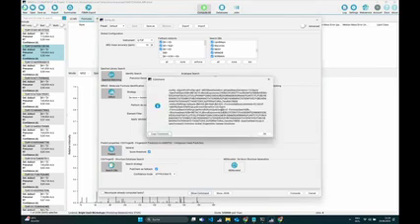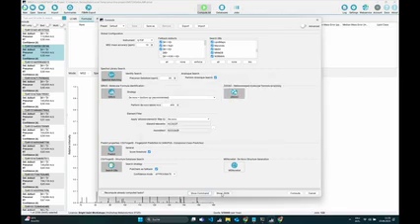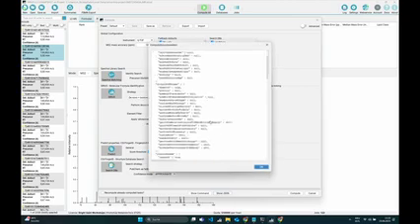And this might also be interesting for you if you don't have a very powerful laptop, or you just want to run everything on some compute cluster. What you might want to do is set everything up in this dialog, and then just copy this command. There's this copy command button also here, and then just run this on your compute cluster. And everything that you have set will be then executed as you wanted it. There's also now this new show JSON button, but this also just shows you the settings, and you can maybe save them somewhere if you want.